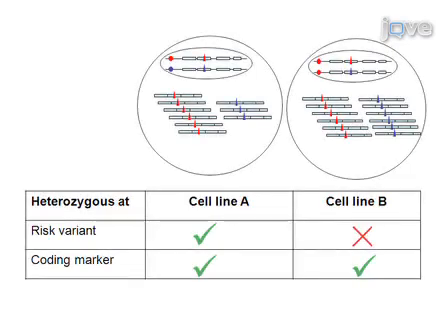The cells used for this assay should express the gene of interest, as well as meet 2 fundamental genotypic requirements. They have to be heterozygous both for the DNA sequences associated with disease and for DNA markers, which can distinguish transcripts based on their chromosomal origin.